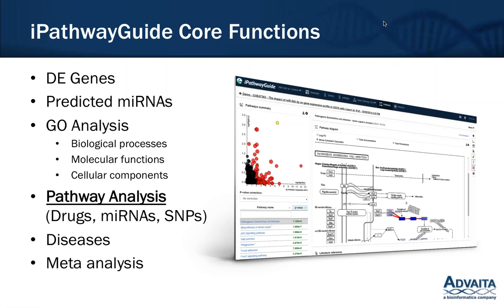The iPathwayGuide application is really designed for looking at protein and gene expression data and giving you that tertiary analysis, and I'll explain what that means in just a minute. Basically, we have an analysis of what are your DE genes. We predict the active microRNAs. We do a gene ontology analysis, as well as a pathway analysis with the ability to model drugs, microRNAs, and SNPs. We also have the ability to identify enriched diseases, and we also have a meta-analysis feature. And I'll go into each one of these in the live demonstration.